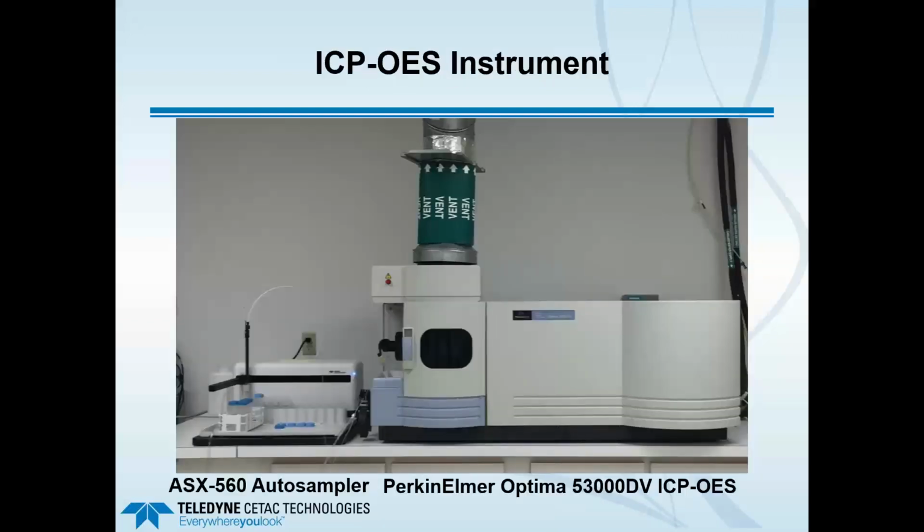So here is a picture of the ICP-OES instrument that was used in the study. This is the PerkinElmer Optima 5300 DV. Next to it is an example of one of the auto samplers also available from Teledyne CETAC to automate the method. That's an ASX560, but that gives you an idea of the dimensions of the equipment that's used.